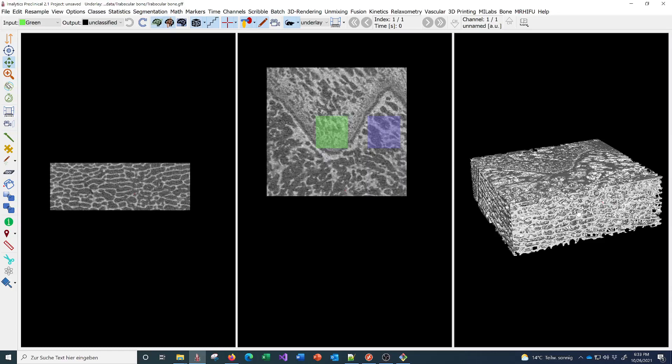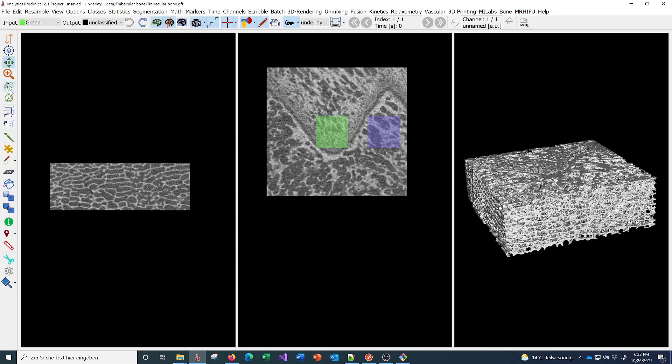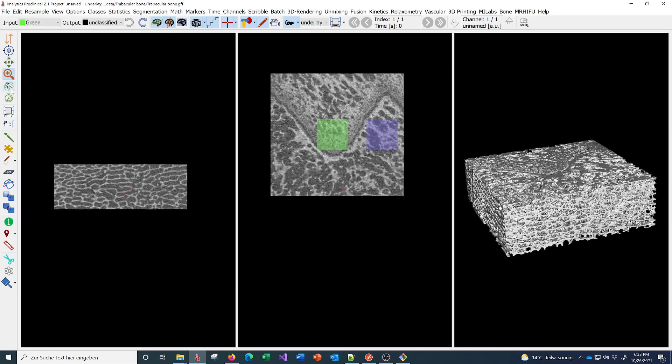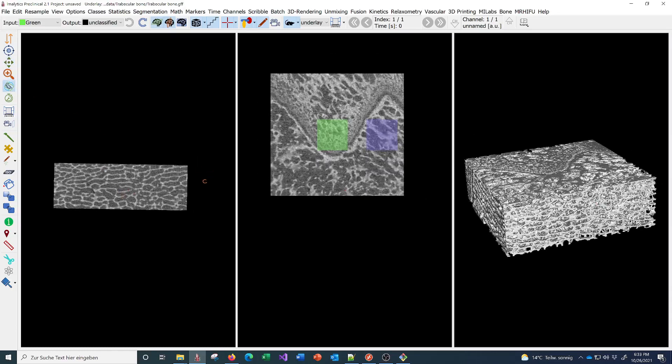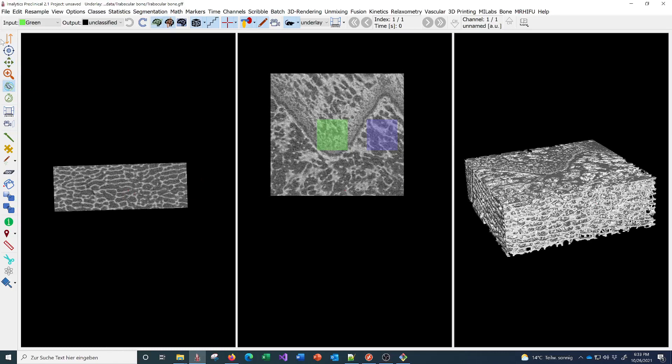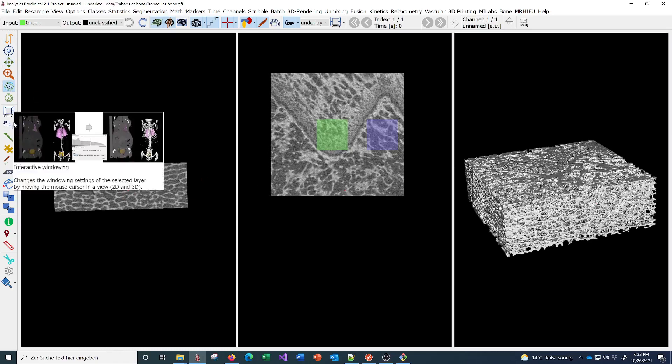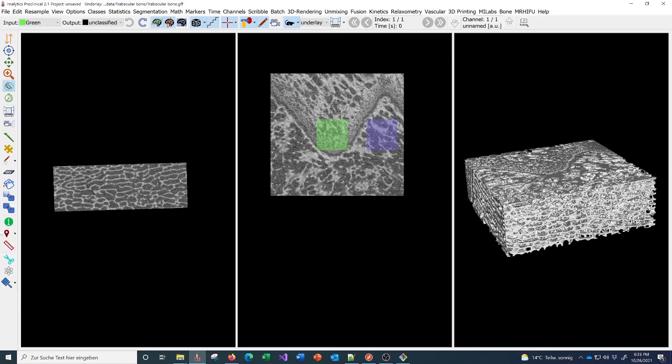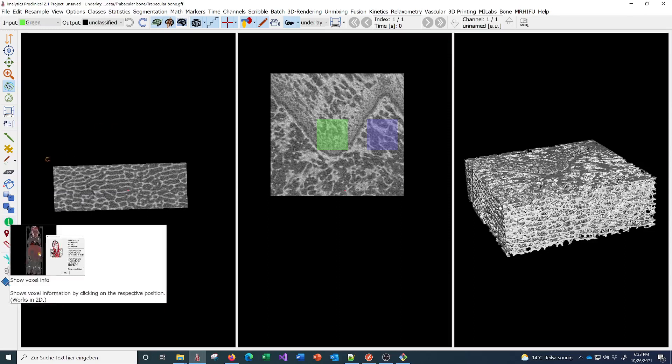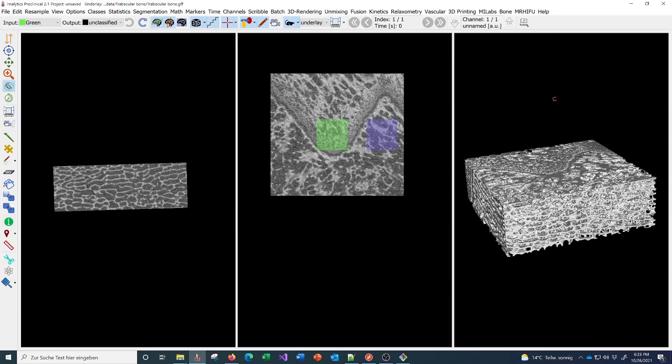This is for zooming, this is for rotation. So all these are setting what your mouse does. That is also described in one of the next tutorial videos.